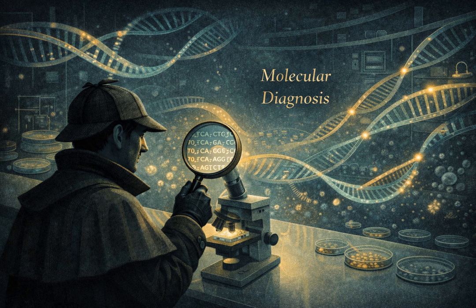But as it builds the new strand, it acts like a snowplow. It physically pushes the old nicked strand out of the way. It displaces it. Hence the name. Yeah. And that displaced strand is now a new single-stranded target for more primers to bind to and the whole process to repeat. It's a continuous chain reaction at one temperature. I love that snowplow metaphor.